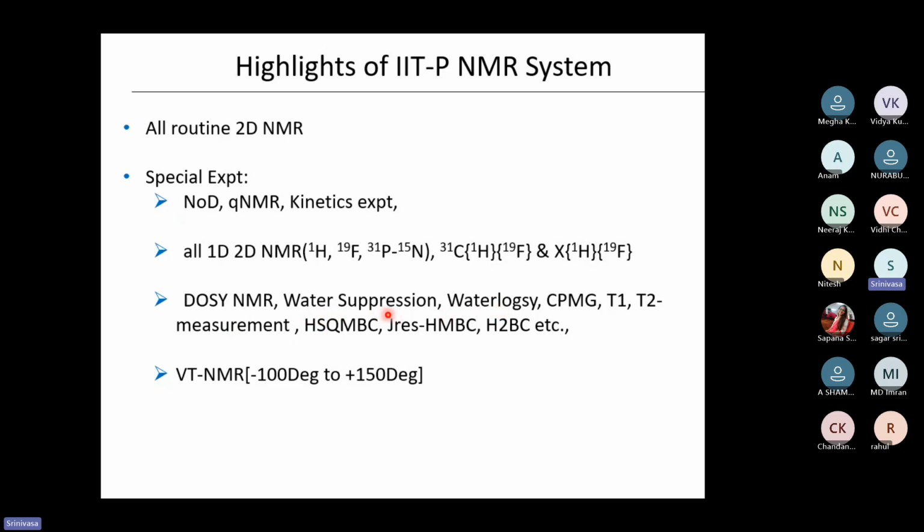Water suppression is basically, suppose you have a huge water signal in your sample spectra and you want to suppress that peak, you can suppress your water signal from your spectra. WaterLOGSY is something like the STD, saturation transfer difference experiment, for protein-ligand binding which is mediated by the waters. You can hit the waters, and if a ligand is bound to a protein, it will interact, and you can see the signal in the WaterLOGSY experiment.